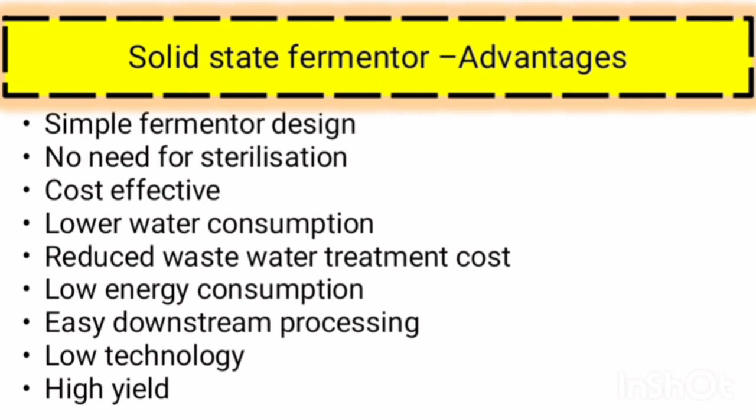Another advantage is the low energy consumption, and also it involves easy downstream processing. Solid state fermentation process can produce high yield and it requires only low technology.